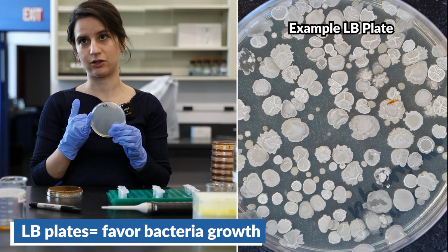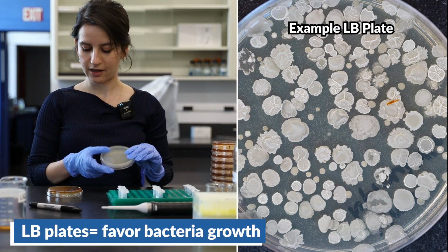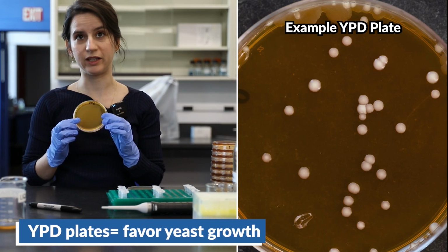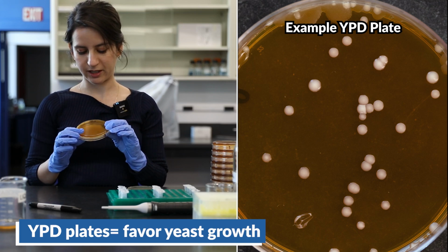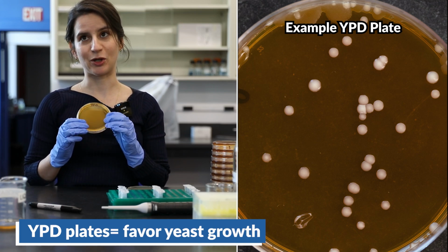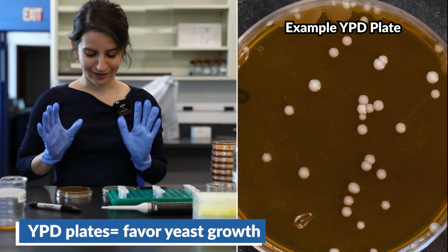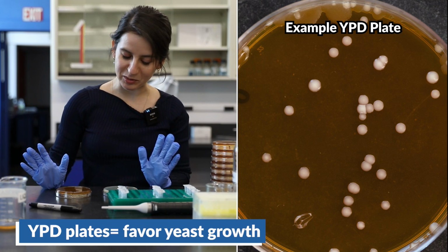LB stands for lysogeny broth plates. And then we have YPD plates, which are what yeast prefer to grow on. YPD stands for yeast peptone dextrose. They're similarly composed, but slightly different.